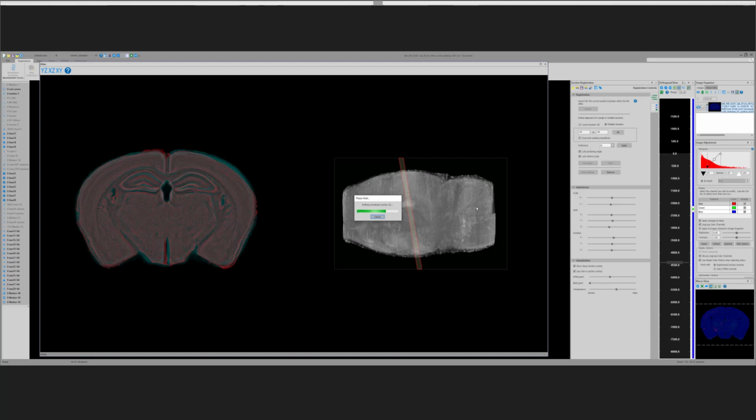Again, it's automatic. We'll do a webinar on that. Doing this registration takes between 2 and 3 hours of computing time. It takes 10 to 15 minutes to set it up, and 2 to 3 hours to have the computer run the program. So we can run on average 2 brains a day using this program.